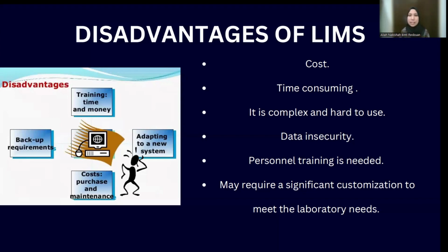And the last disadvantage would be that it requires significant customization to meet the laboratory's needs, because each laboratory needs a different software. So the LIMS in each laboratory is different, and this could also consume time.